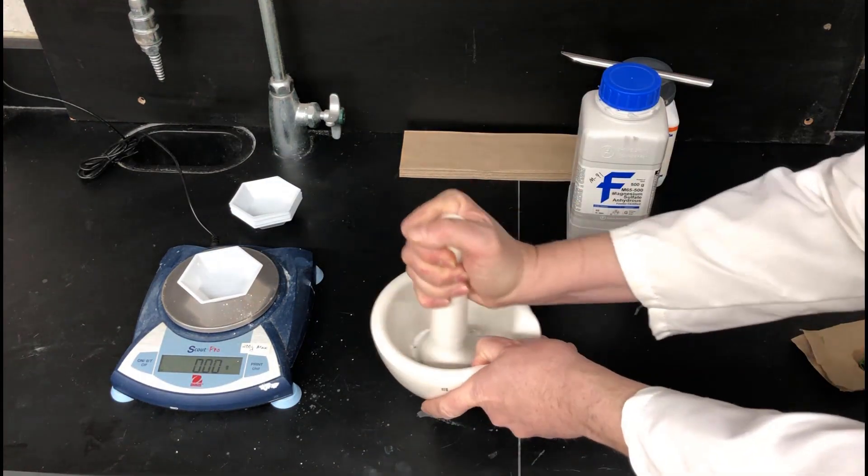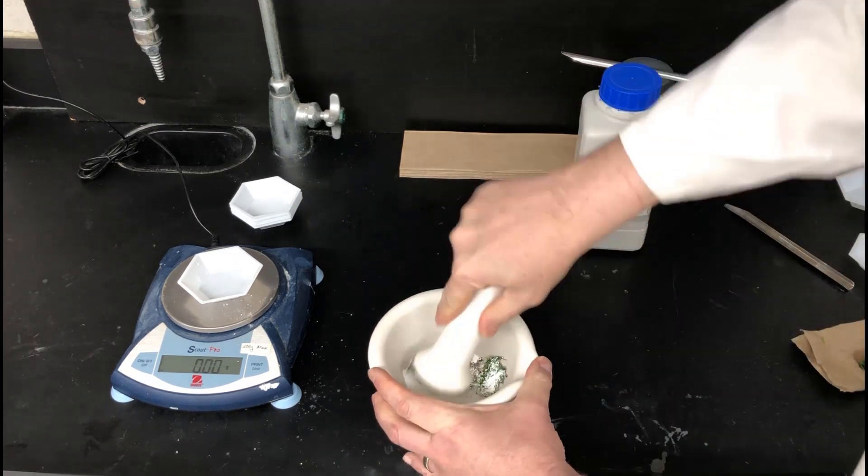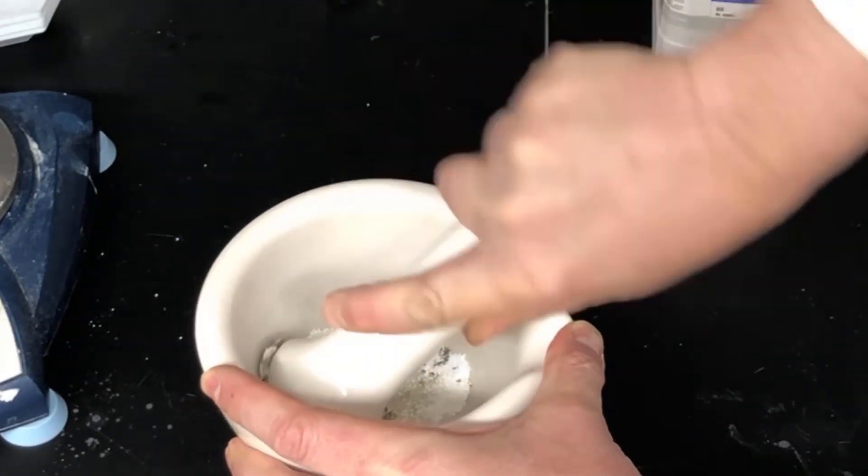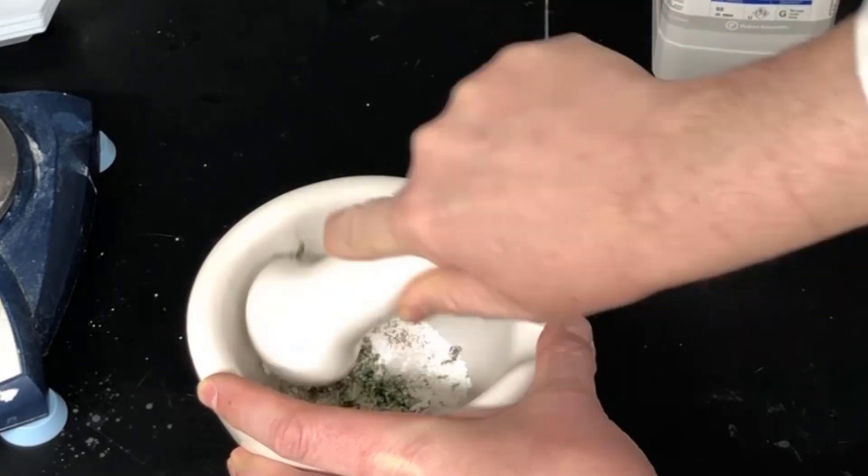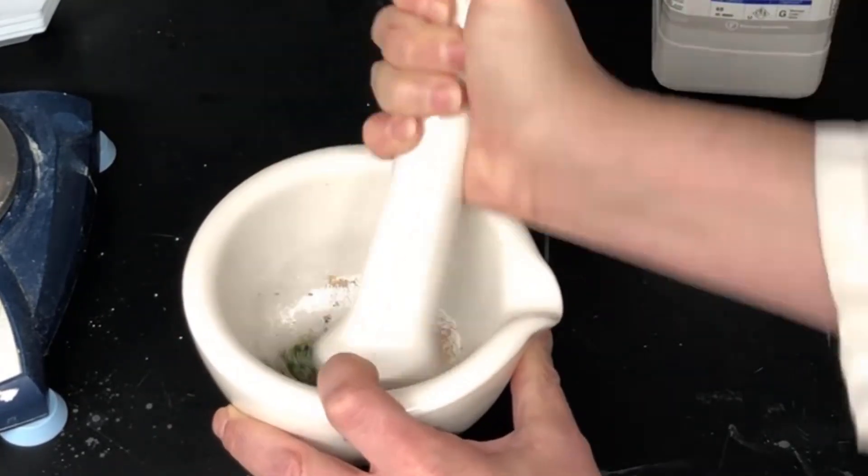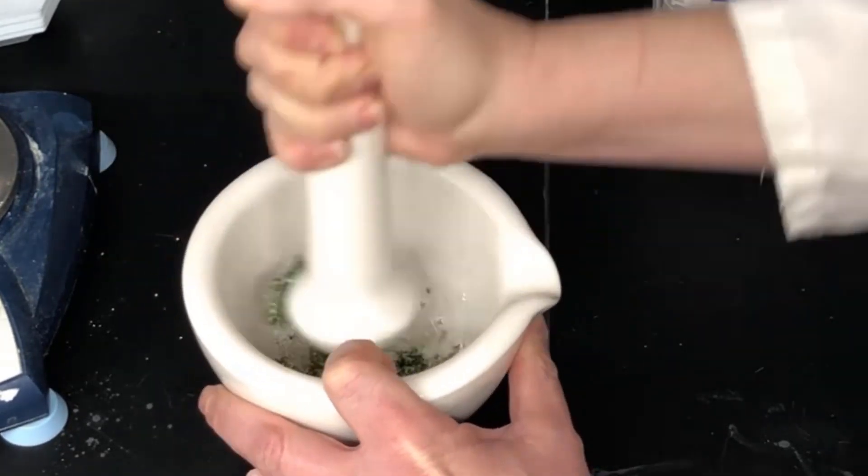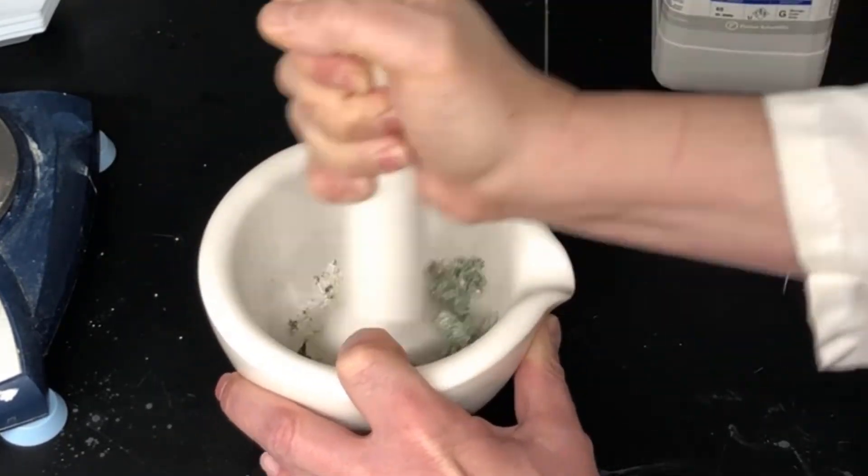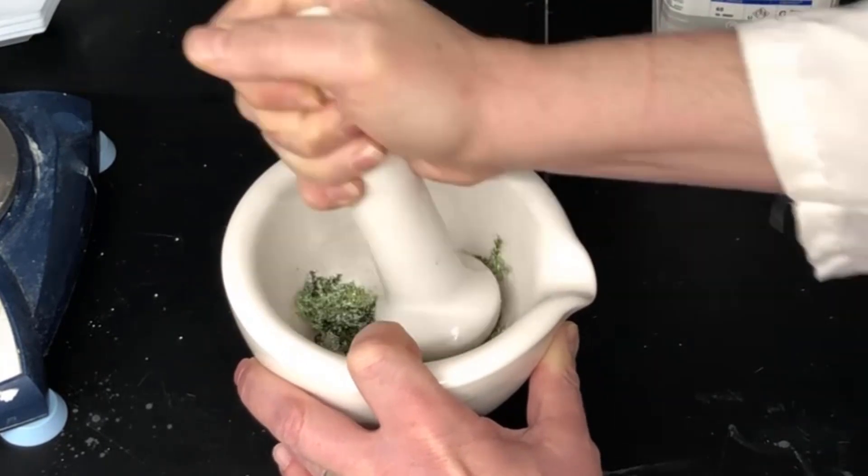Then you need to grind this. You're going to want to really put your back into this. You have to really press pretty hard. You have to press the drying agent and the sand into the leaves and sort of pound them and squish them and crush them and just basically try to homogenize that mixture.